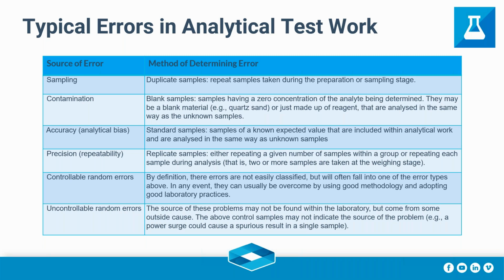Some errors are controllable, some are not, and for those controllable errors, that's where our QC module will help.